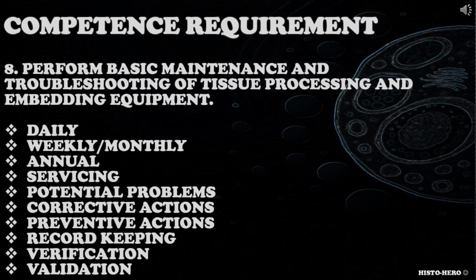When addressing this competence requirement, candidate could consider daily, weekly, and annual maintenance, need for servicing, potential sources of problems with equipment, corrective and preventive actions that can be introduced to prevent problems, record keeping, verification, validation and so on.